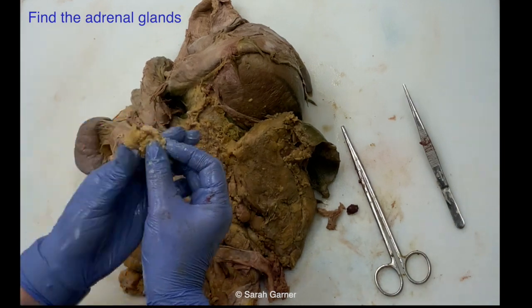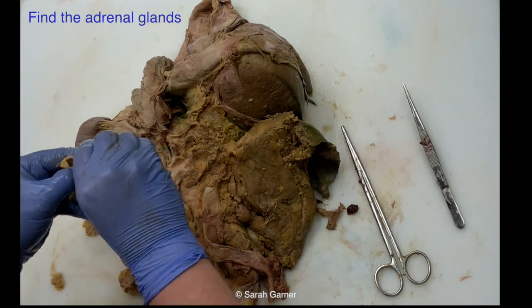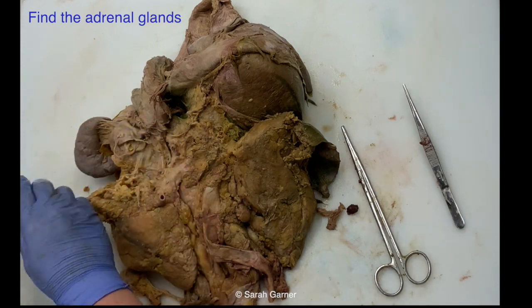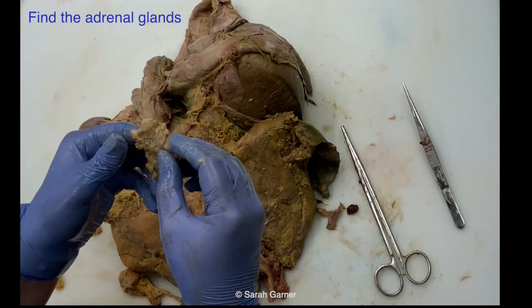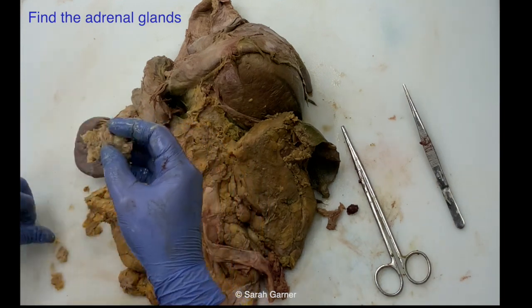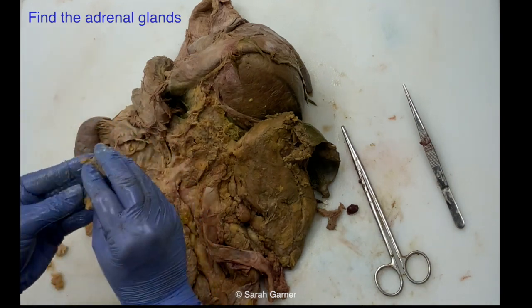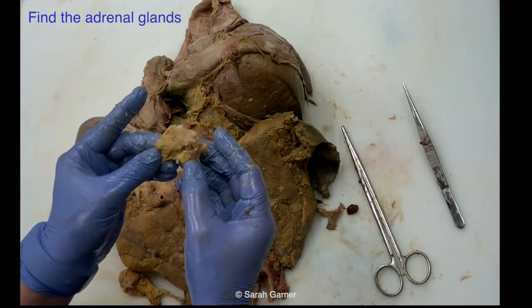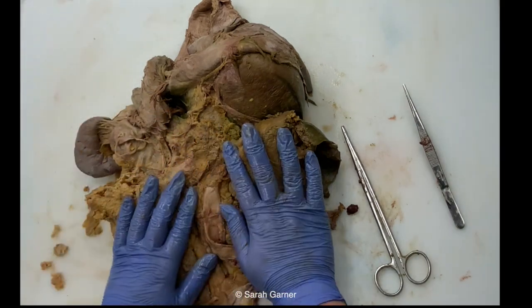So here it is. So again, you want to peel off some of that extra fat, make sure you're getting an accurate weight, and if you need measurements, you can get accurate measurements. And there's our adrenal. In reality, I'd probably clean this up a little bit more, but for our purposes, this is going to be good. So again, sit it where you know what it is. I'm going to sit this over here, this is going to be my left. So we've got our adrenals.